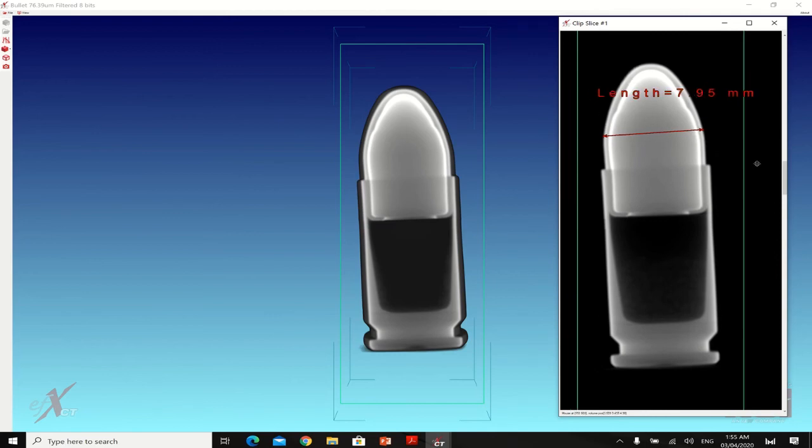Okay, so again, may I remind that this will not save in terms of what you are viewing now, but in terms of viewing or getting a saved image is by doing a snap. Okay, so there is a difference between snapping this plane and also snapping this 3D volume. So in terms of snapping this 2D volume, you just have to right click, then go to video and snap, then take a snapshot. Okay, so don't you worry, something happened, but we'll explain it later.